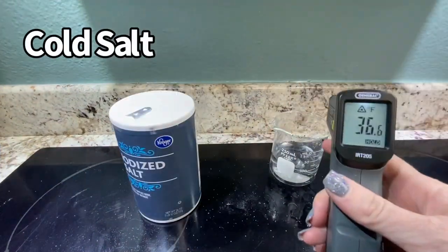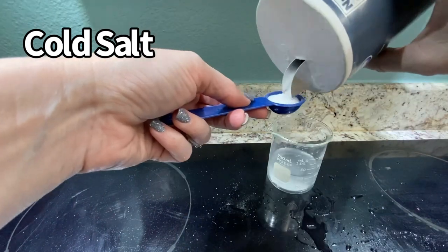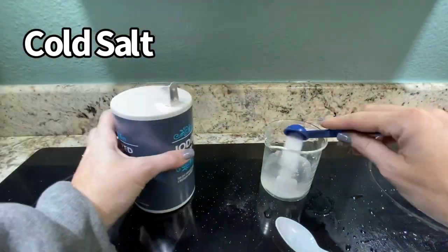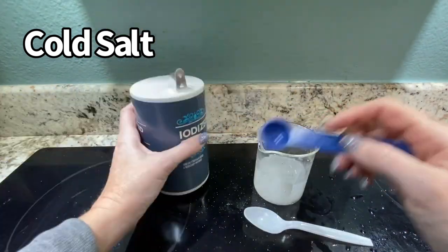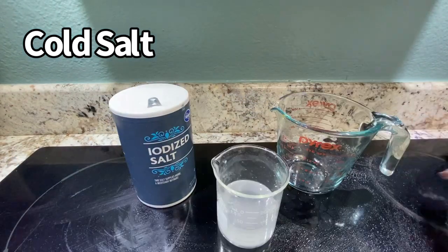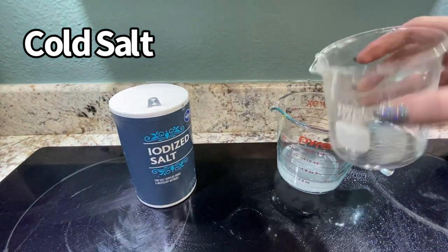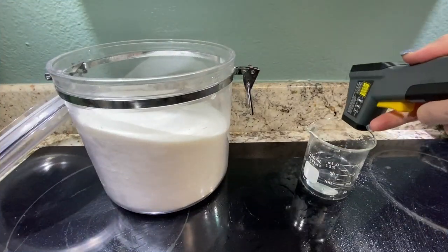Now same deal with salt — at 36 degrees Fahrenheit. We're going to go 5, 10, 15, 20, 25, 30. We got about 30 milliliters of salt. You can see it saturated down at the bottom — that didn't dissolve.